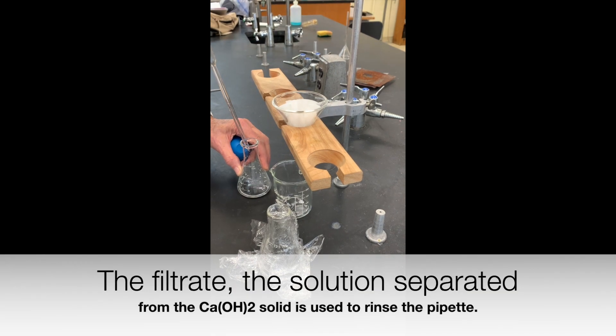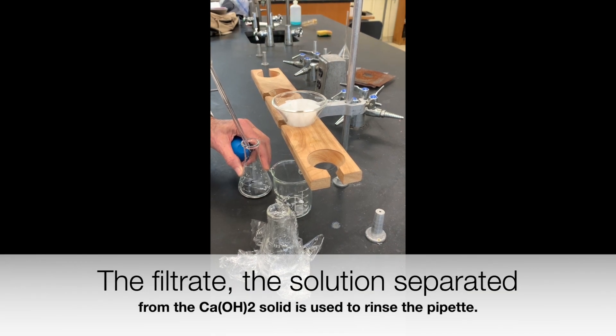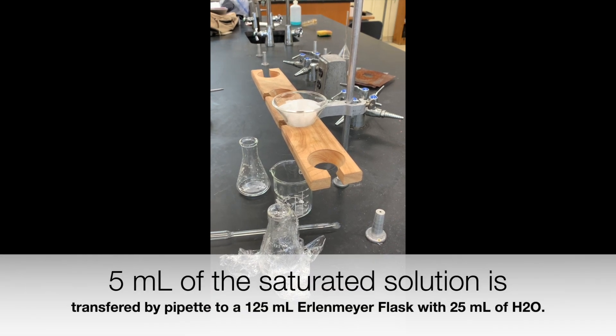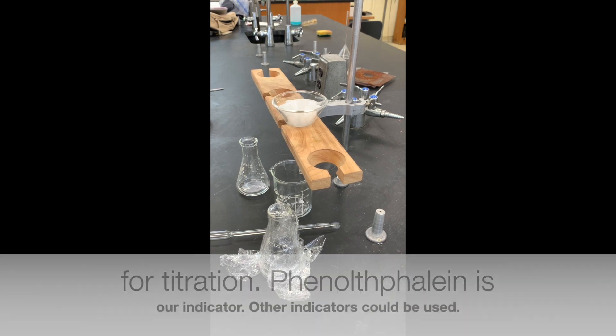The filtrate, the solution separated from the calcium hydroxide solid, is used to rinse the pipette. Then five milliliters will be removed using the pipette and added to an Erlenmeyer flask for titration.